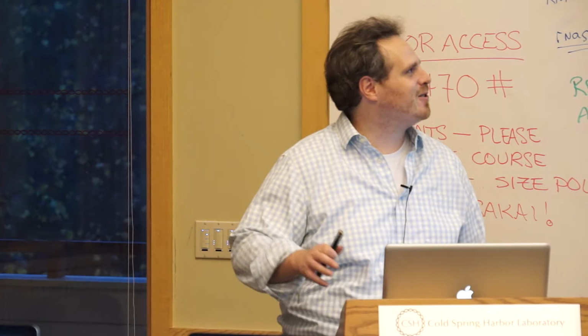I would never do it again. It was a miserable assembly. So we're going to redo it with PacBio and, you know, pray that it gets better. Okay. So how do you install it?